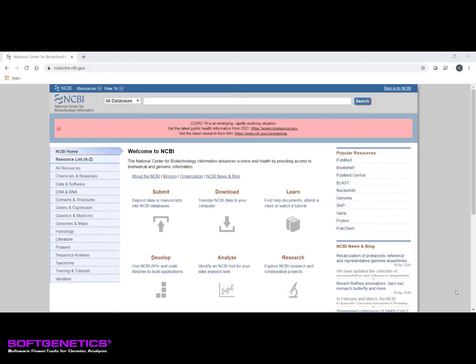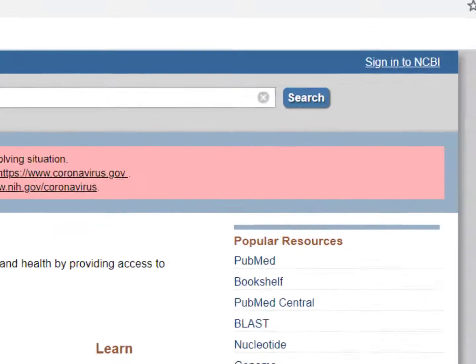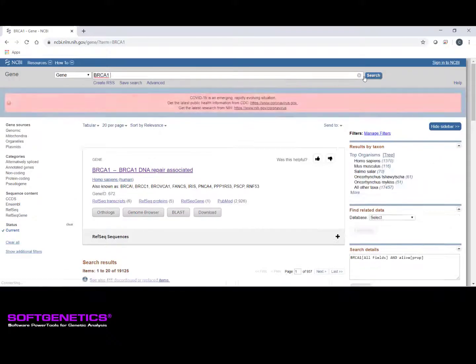GenBank files are commonly downloaded from the NCBI GenBank database. We can begin by navigating to the NCBI homepage in an internet browser. You can select the GenBank database by navigating to the drop-down arrow and selecting Gene. Once this is selected, type in your specific gene of interest for which you wish to download a GenBank file. In this example, I will search for BRCA1. Click Search and any related results to your gene will appear, with the specific species listed in brackets.